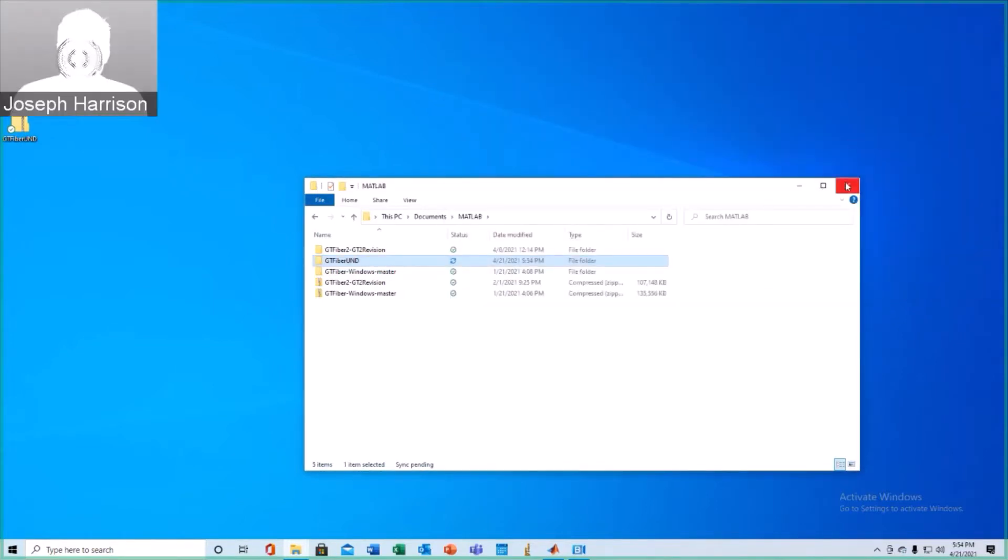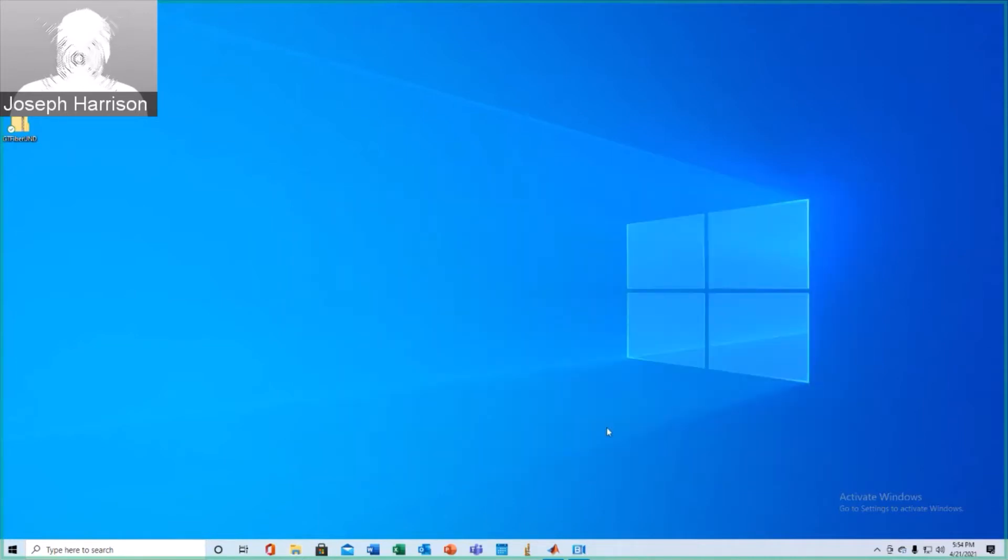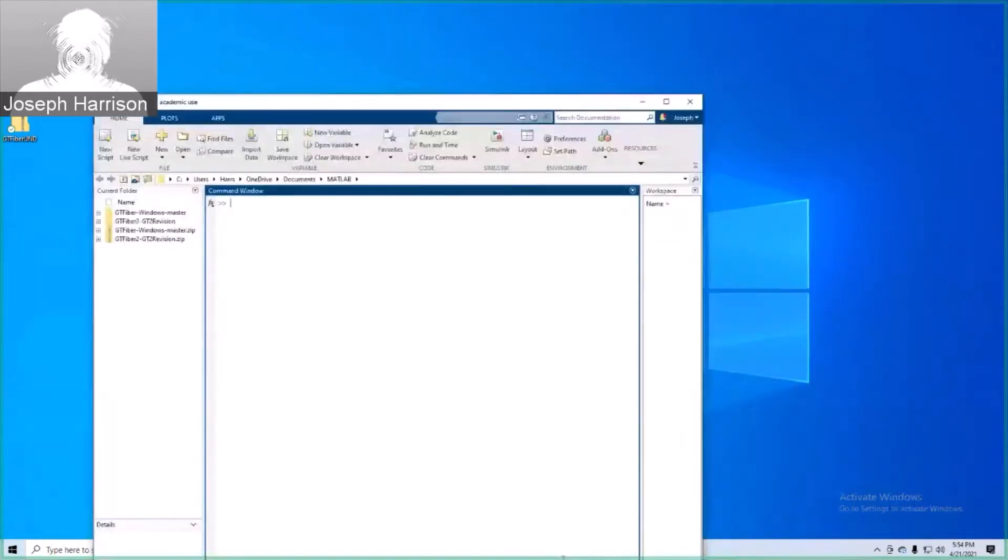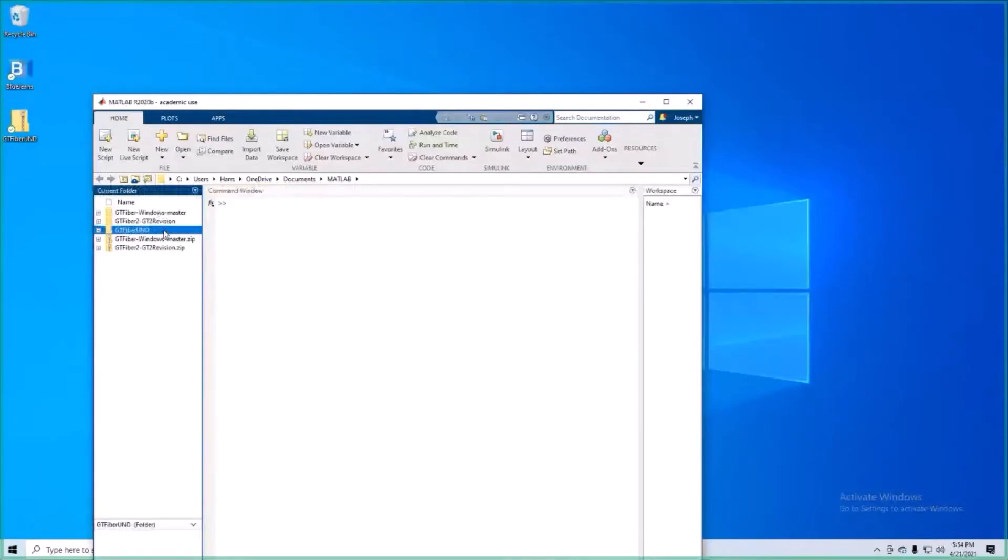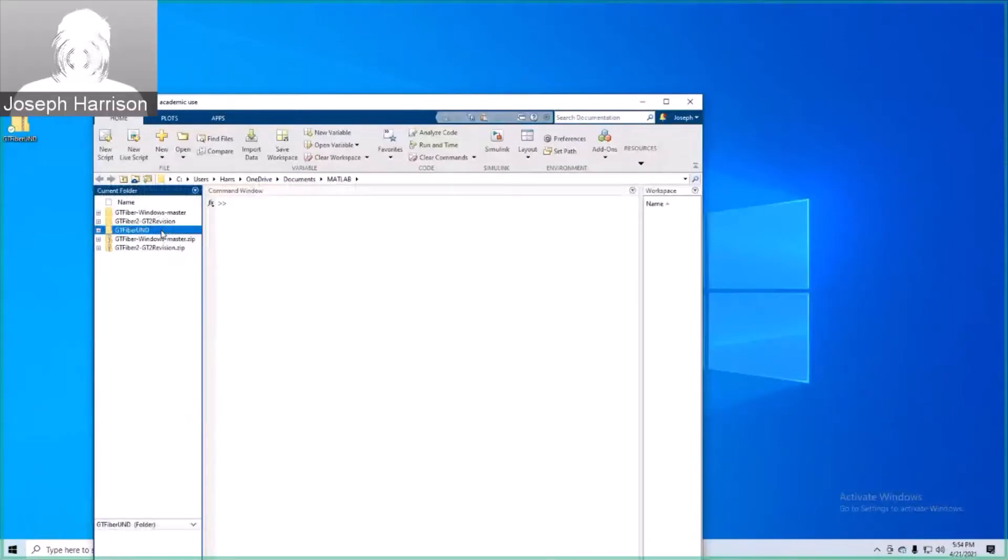Alright, now that we've extracted it to the appropriate folder, we can go ahead and open this in MATLAB. As you can see, this folder is now located on the pathway. I'm going to open it.